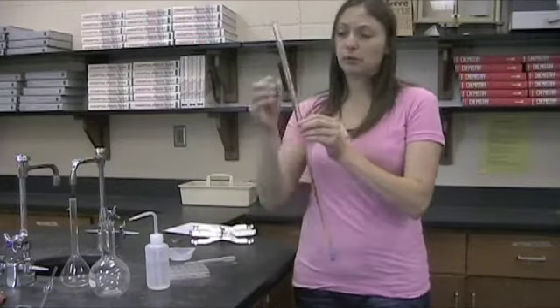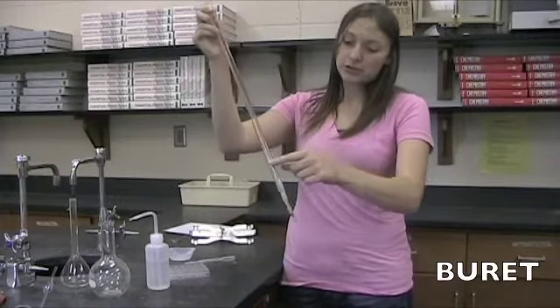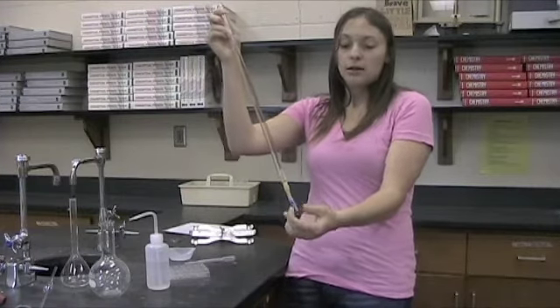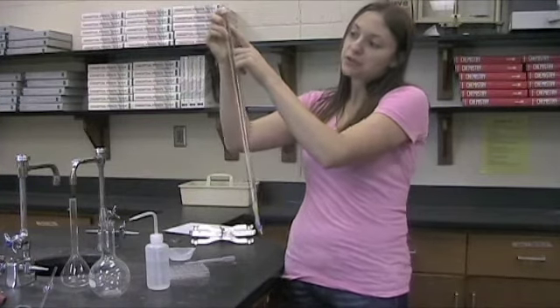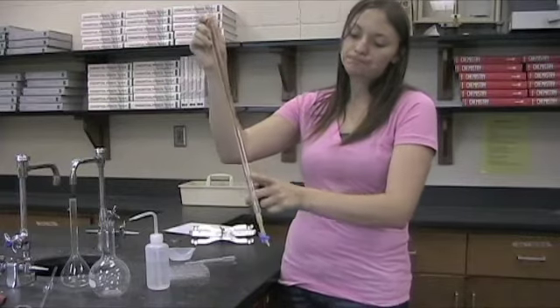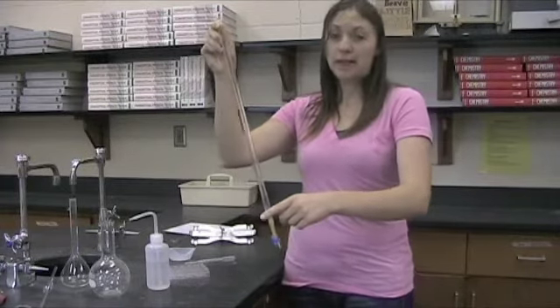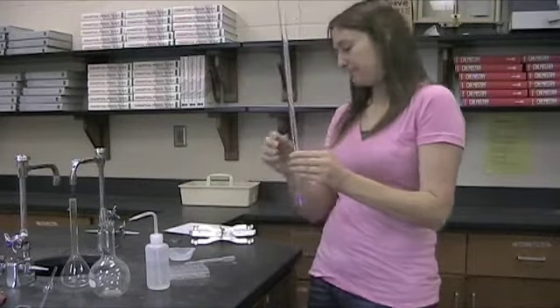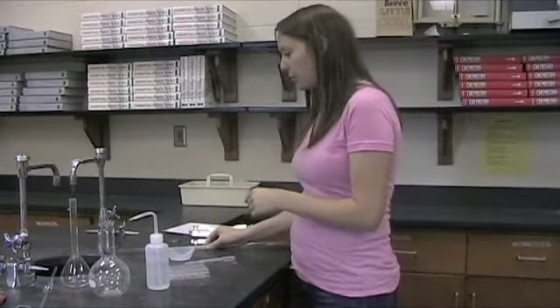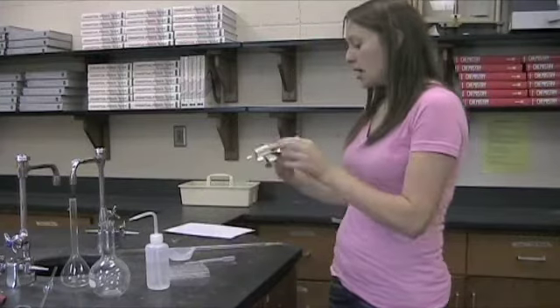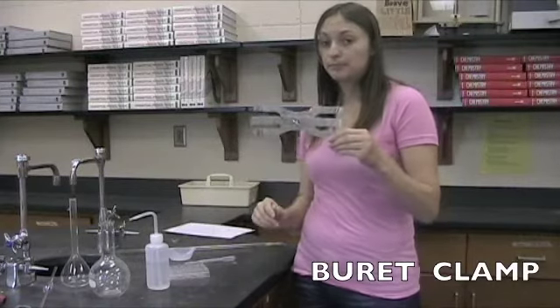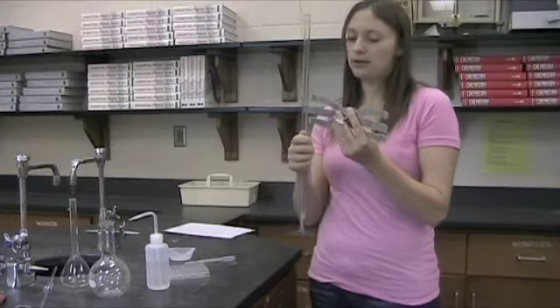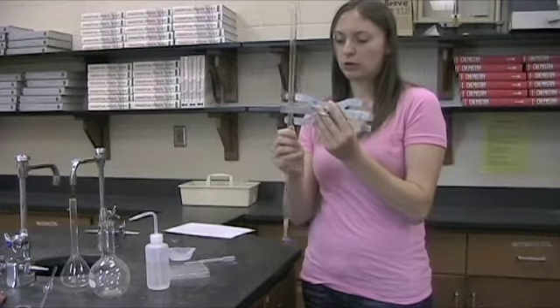We have a burette which has lots and lots of little graduations on it. And then down here at the bottom it has what's called a stopcock. What happens with these is you will dispense a certain amount of liquid into a beaker or a flask. And they are often used for what are called titrations. Well, in order with a burette, you have what's called a burette clamp. And the burette fits right inside. And that way you don't have to worry about holding onto it.